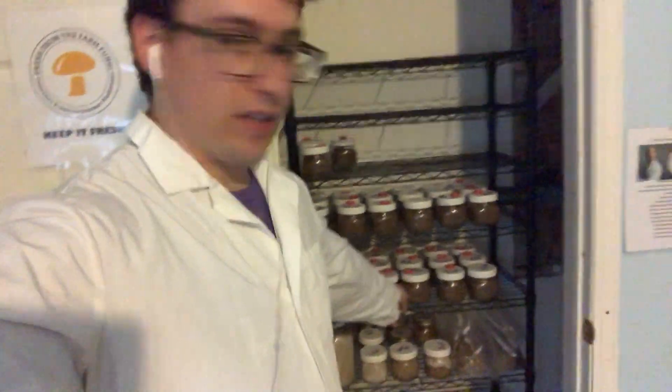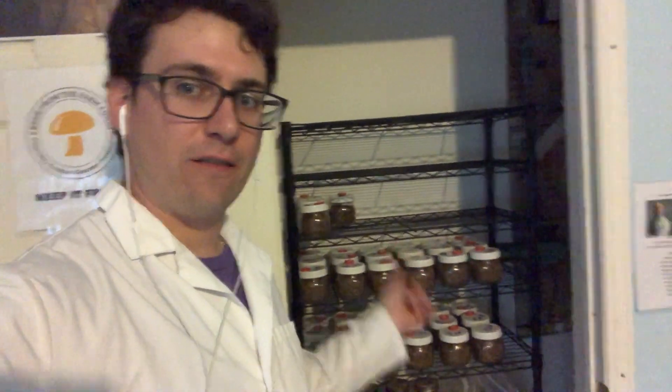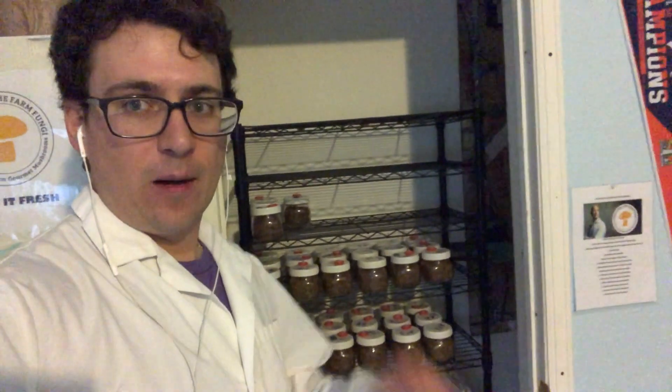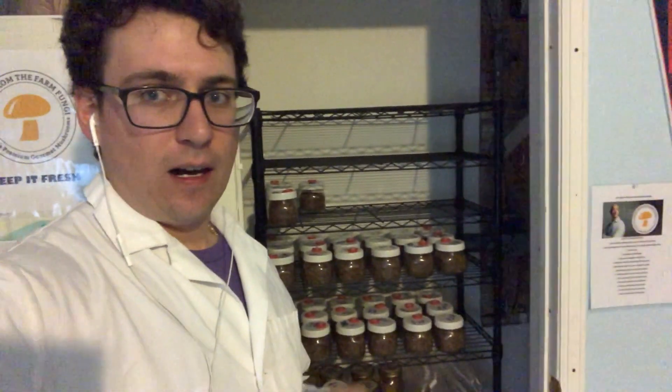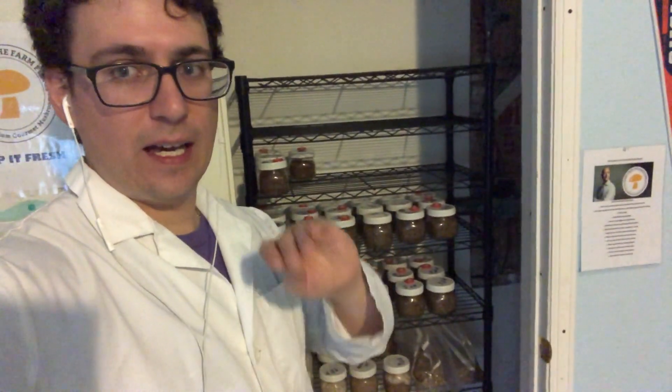I've got the rest of the cultures on grain and they're going to be incubating until they're ready to go into a fruiting substrate. I'll keep you updated — I'm going to be paying close attention to see what strains are growing the fastest and most vigorously, and my hope is to get some fruits by May. I'm going to be posting some slant cultures on Etsy in the next couple days. It's a perfect time to start growing out your mycelium if you're trying to get into farmers markets or doing outdoor grows.